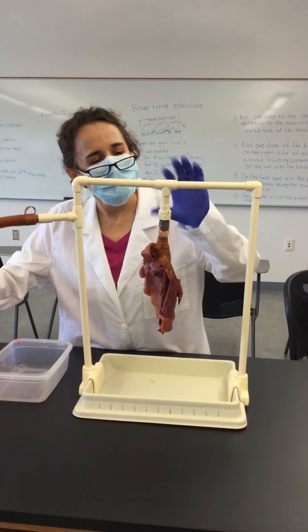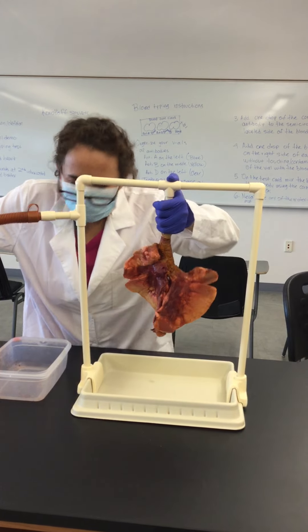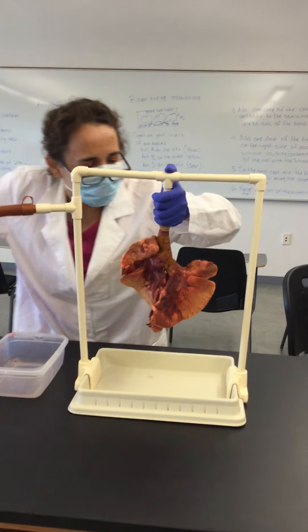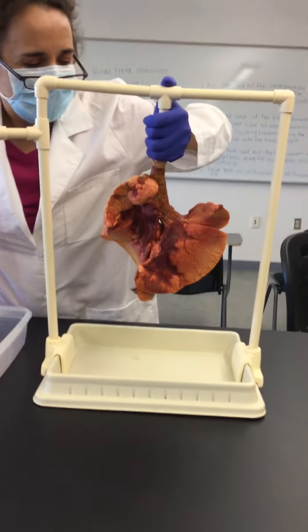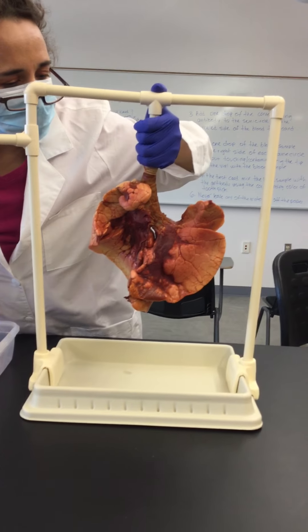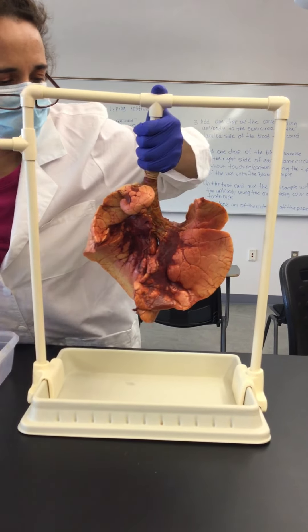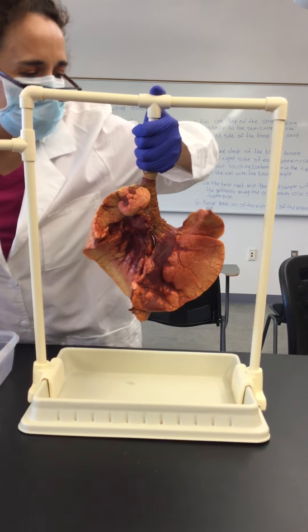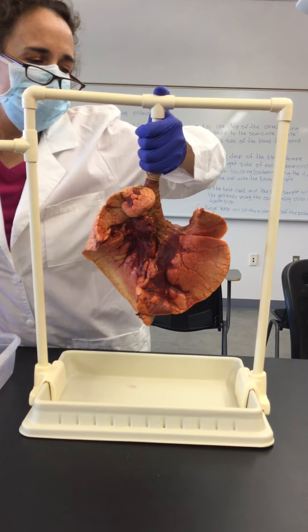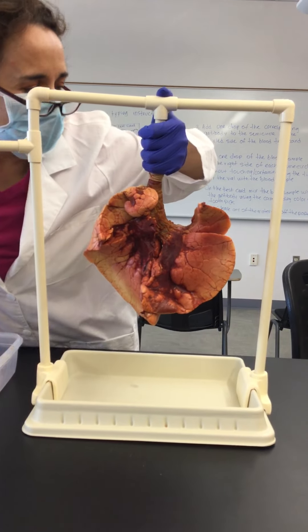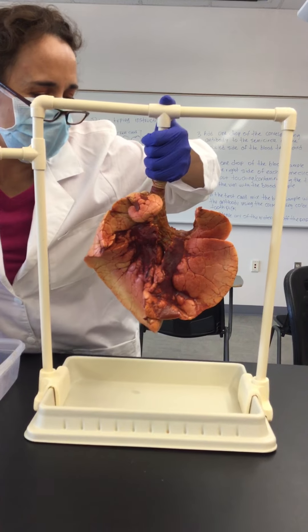I will have to hold it so it won't detach, and you can see how the lungs inflate. Inflation means inhalation; deflation means exhalation.